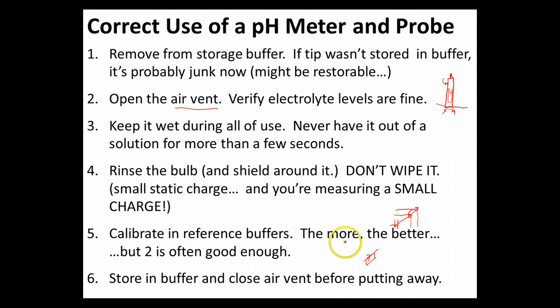Once you've gone through all of your experiment and logged all your data, when you're cleaning up for the day, make sure you put your tip back into that vial of pink buffer solution. Make sure you close your air vent so that all of that electrolyte isn't leaking out. Then put the thing away — wipe it down if there's any splatter on it. So: clean it, store it in buffer, close the air vent. That's the basic way to use a pH meter and probe correctly.